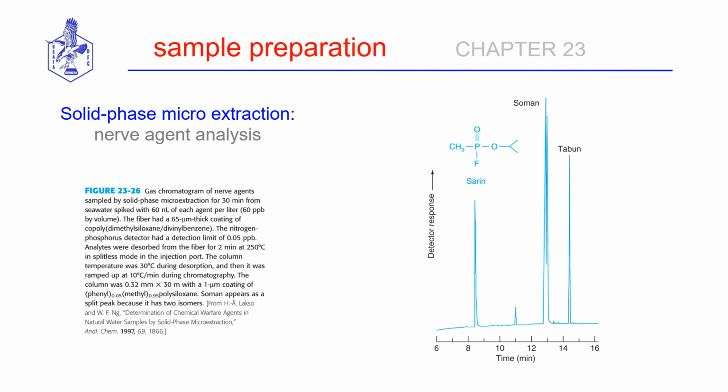This slide simply shows a successful application of solid phase microextraction for trace quantities of nerve agents. Just a timely and appropriate set of samples that you may come across, seeing as how chemical weapons are no longer allowed, and all of the reserves of chemical weapons in the U.S. have to be destroyed by treaty.